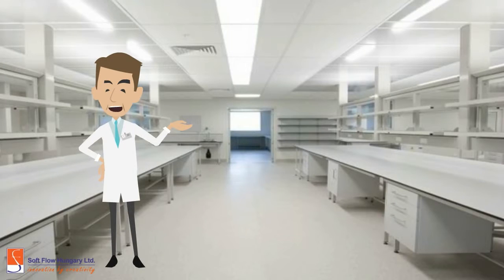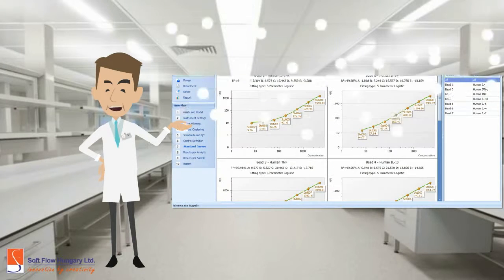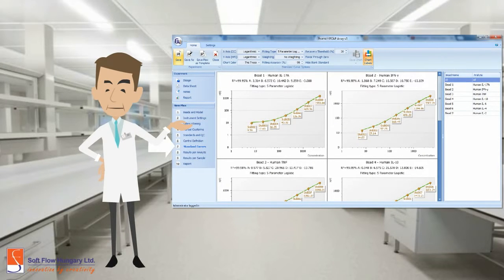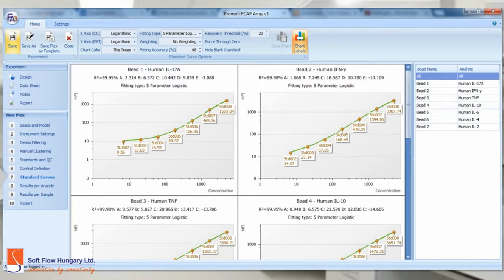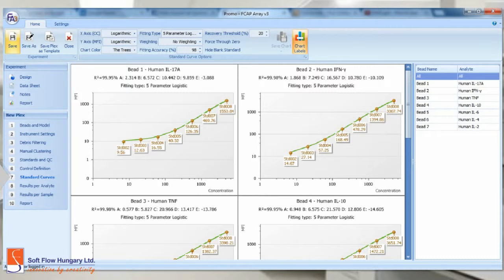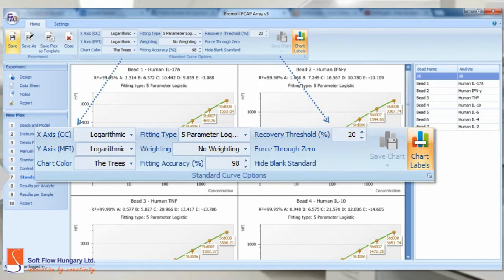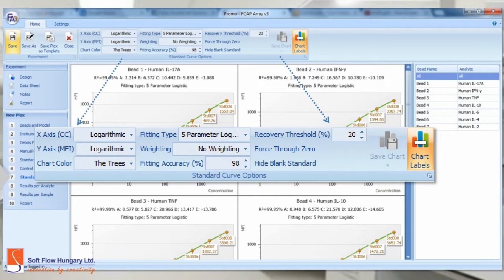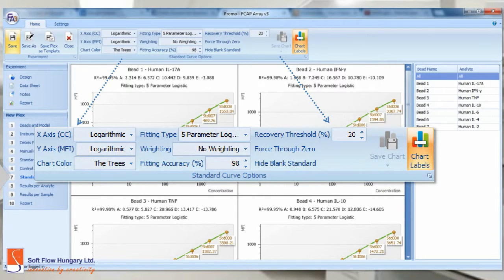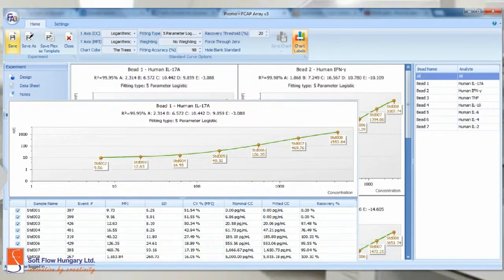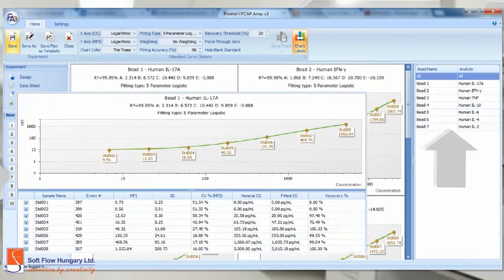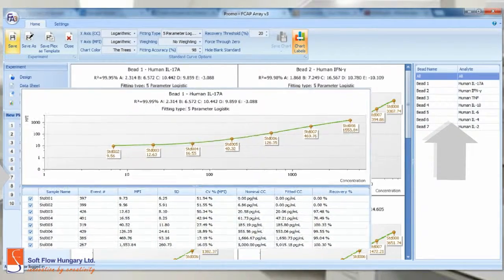Have a closer look on this screen. In the standard curves part, you can easily customize the type of analysis you want to have for your experiment. You can change the axis parameter, the weighting, and the accuracy, for example. It is possible to observe each bead chart separately.